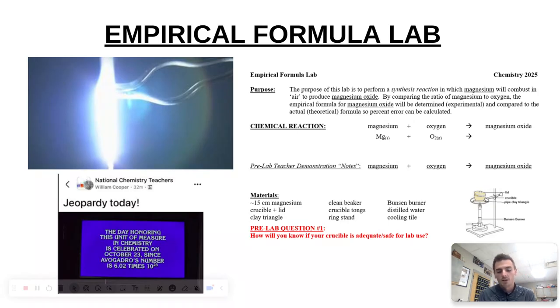This is our pre-lab video for the Magnesium Empirical Formula Lab. So recently in chemistry class, you all did the chalk lab, which was a percent composition lab where we got the part of the whole and we focused on calculations with Avogadro's number and molar mass.